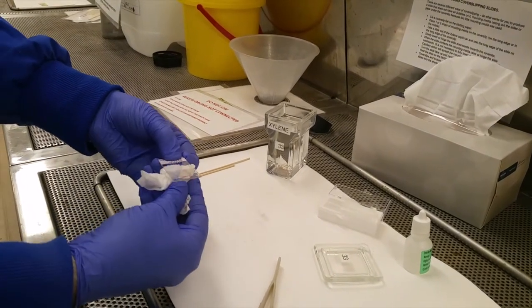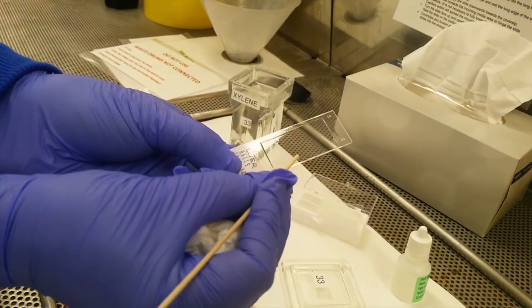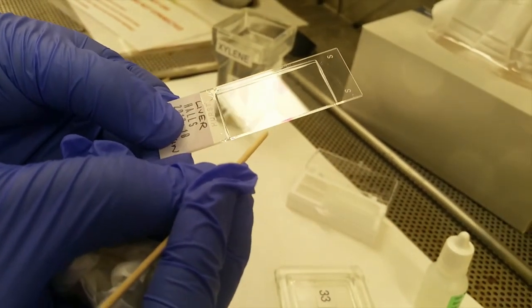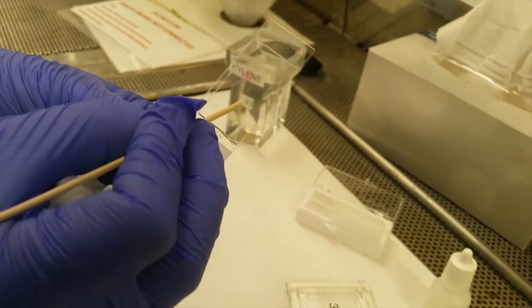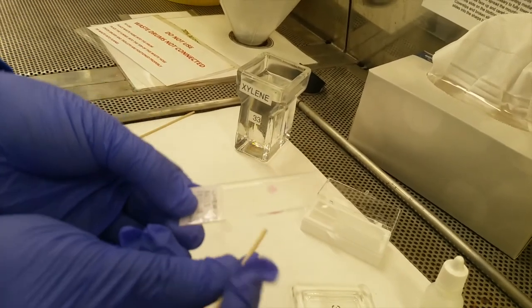Then wiping the back of the slide to remove any residue, and then check for bubbles. Now there is in fact a small bubble that has formed, and you can't quite see it yet, but using the applicator stick you'll see in a moment. I've just identified it there and I'm squeezing it out. Just move it to a slightly different angle, you'll see it now, I think. Okay, small bubble there, squeezing on top with the dry stick, and then it's moved away.